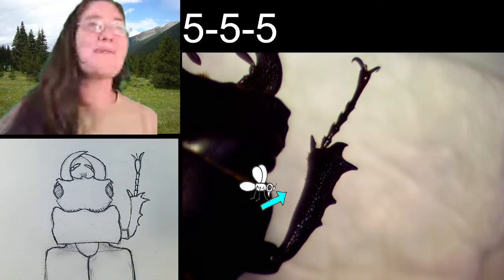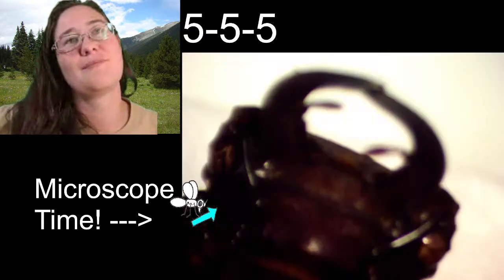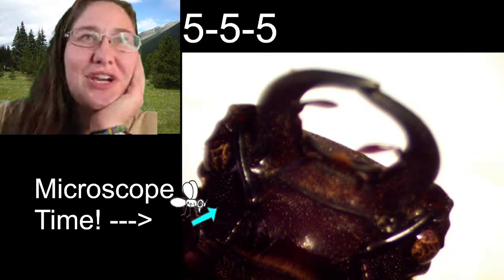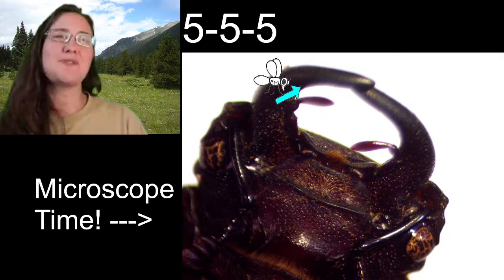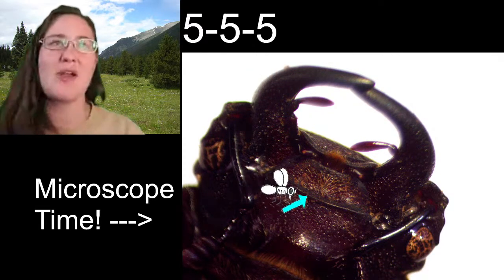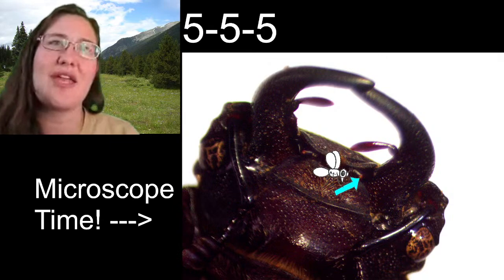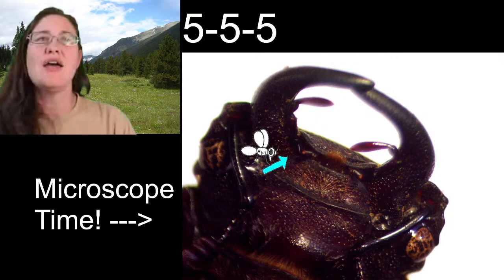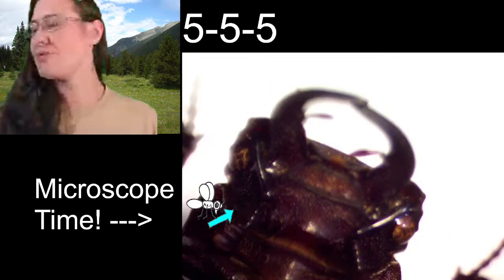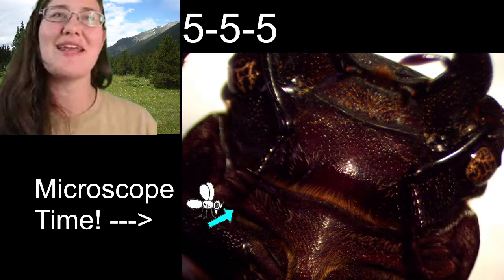I can see the labial palps. So from this bottom view, you can see those maxillary palps from the dorsal point of view, but if you look right here along the bottom, there are these two little stubby guys — one right here and then one right here — those are the labial palps. They almost look like they're one-segmented off of the bottom jaw to help push food into the mouth. But what I really want to do is zoom out and look at the antenna, because honestly stag beetle antenna are really awesome.